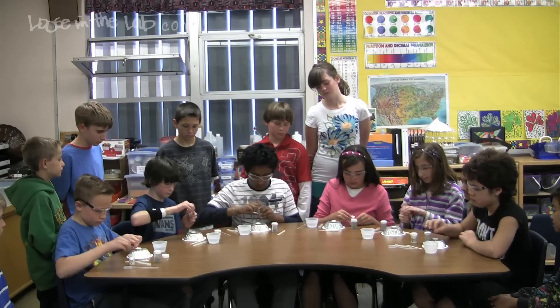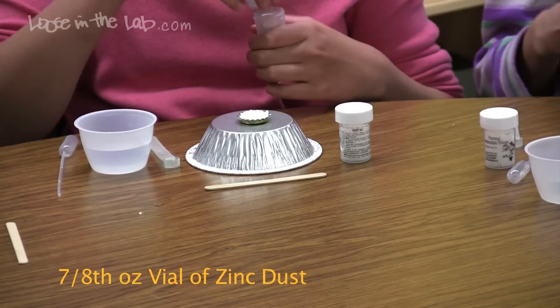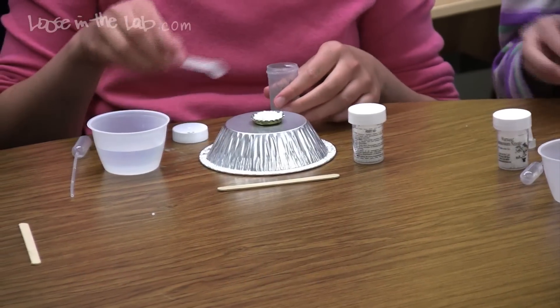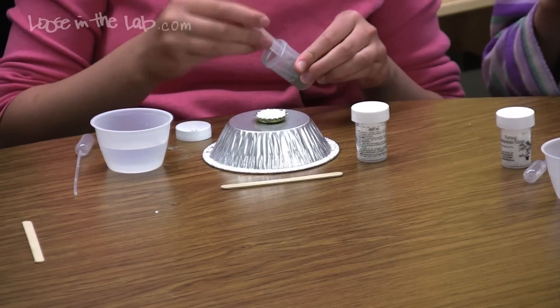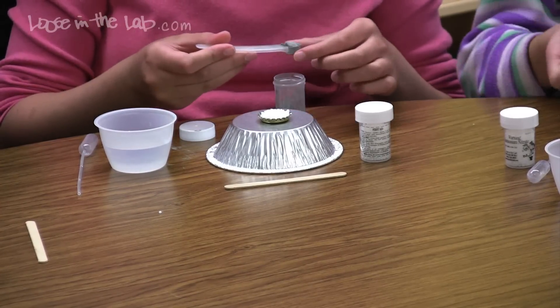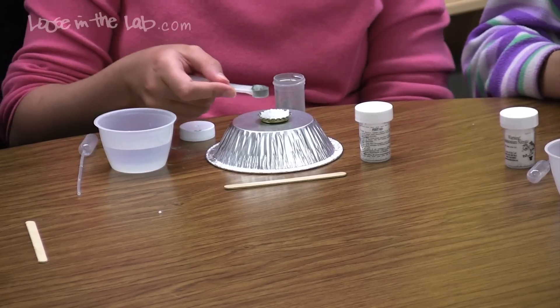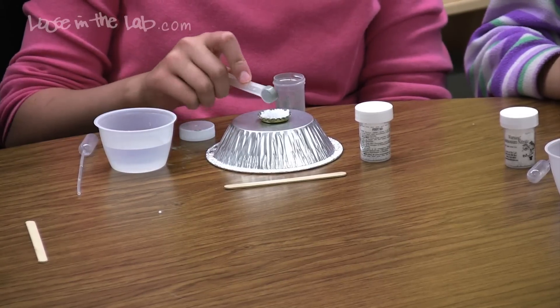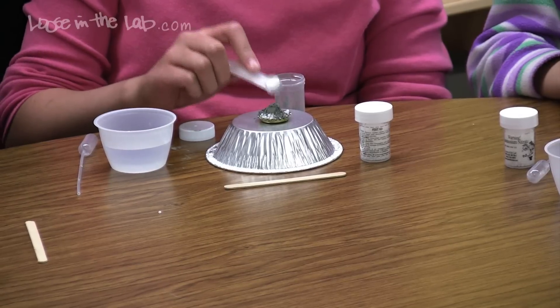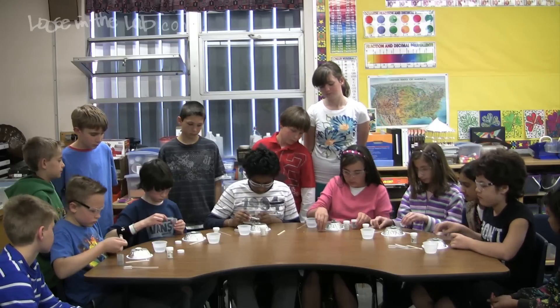Open up the zinc dust, which is the vial that has the black powder in it. Take your scoop and add one scoop of zinc dust to the white ammonium nitrate pellets — just pour it on top. Then put your cap back on the vial of zinc dust.